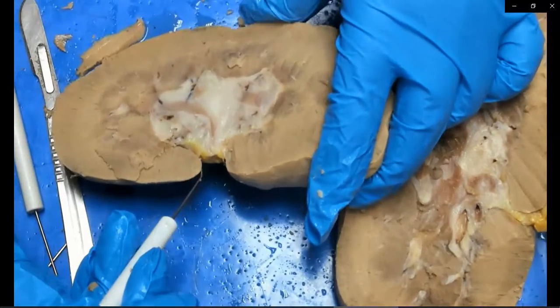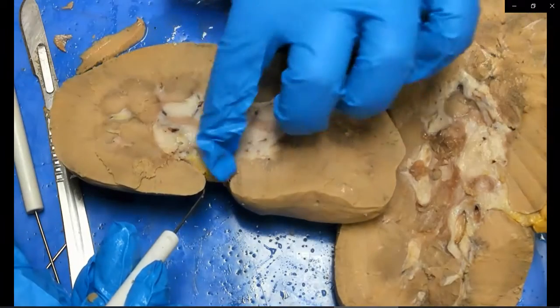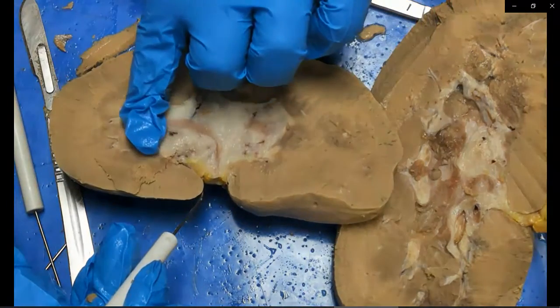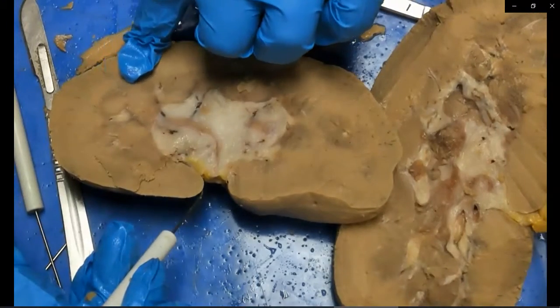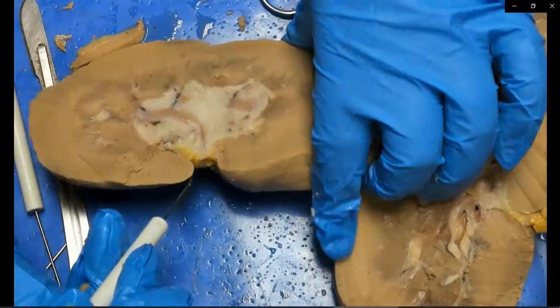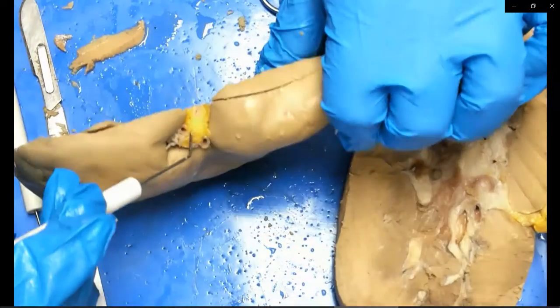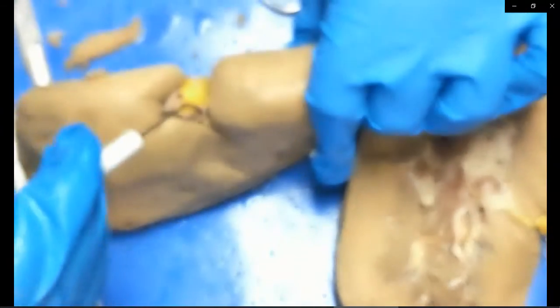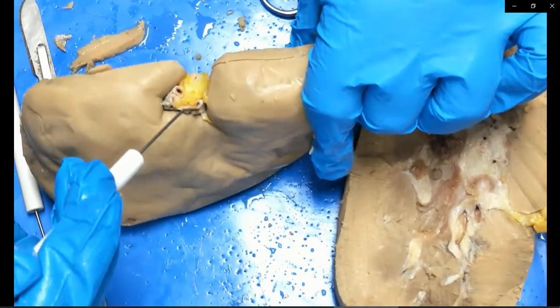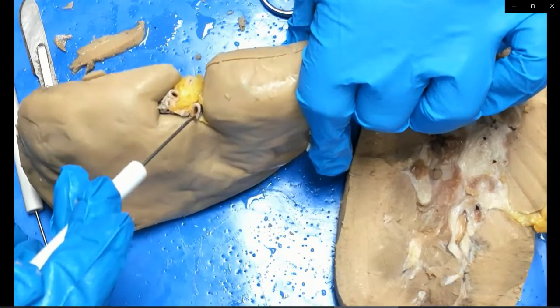And you can see that if I move the probe just a little bit, you'll see it moving through this renal pelvis. So it's going to come up, get filtered through those nephrons, really pretty, out to the cortex, come back down, and it's going to exit. That blood is going to exit through the veins. So that filtered blood exits through this vein back here. It's a little thinner, it's more flexible. I can move it around, so that is your vein.